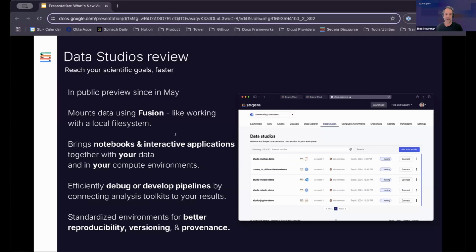Using this foundation, we dynamically build containerized interactive environments adjacent to your cloud-hosted data, bringing compute to the data rather than the traditionally time-consuming and costly approach of transferring large volumes of data to your analysis environment, whether that's your local machine or a specifically provisioned virtual machine.